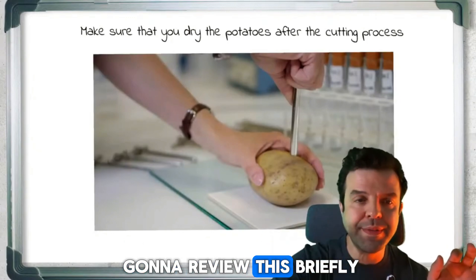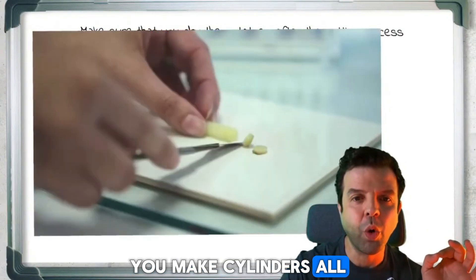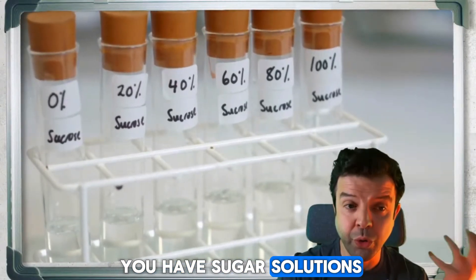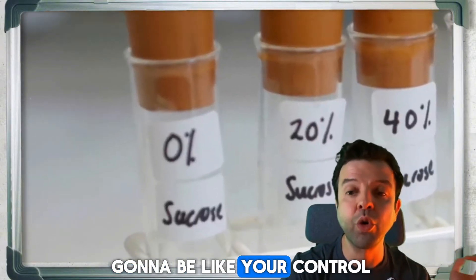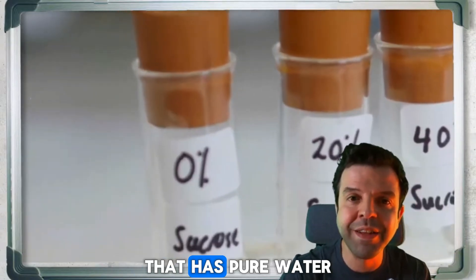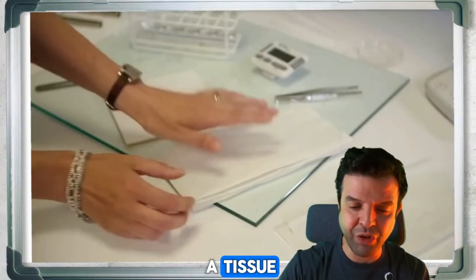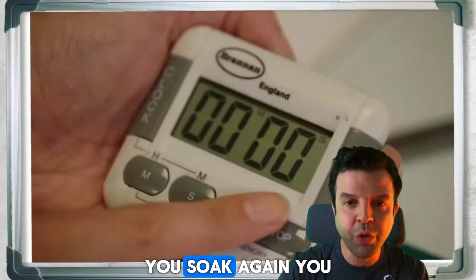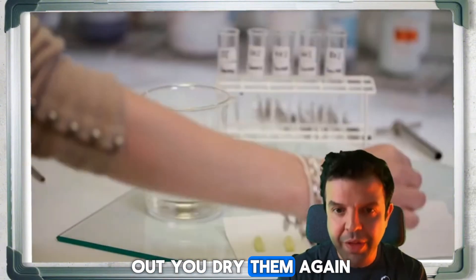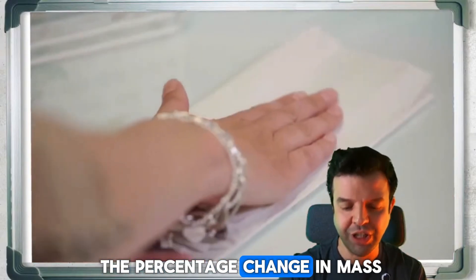To review briefly: step one, use a cork borer to make cylinders, all the same size as best you can. Then prepare sugar solutions — one of them is your control, which has pure water with zero sugar. Take the tissue, dry it, weigh it, then soak it for a minimum of 30 minutes. After soaking, take the cylinders out, dry them again, and measure the percentage change in mass.